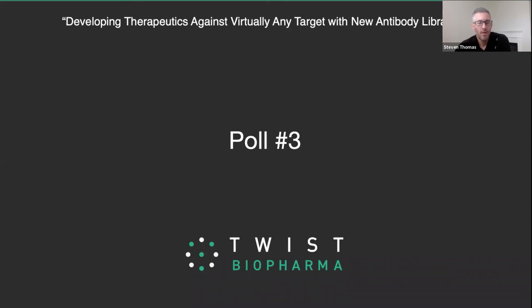So for a soluble protein target, for example, I know that the lab will typically do a high throughput 3x384 well ELISA. And from there, we can pull out literally hundreds of sequences to reformat those as IgG. And so through that process, we'll be able to identify any antibodies that don't express well, and just leave those out essentially.